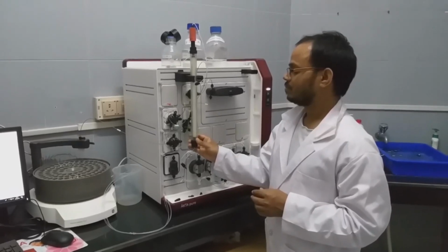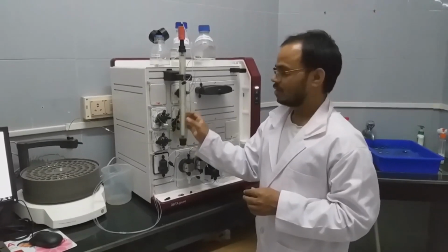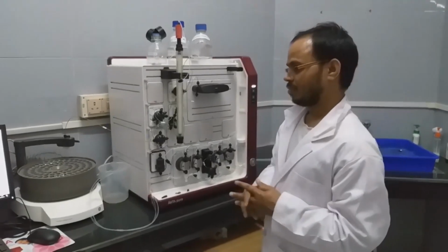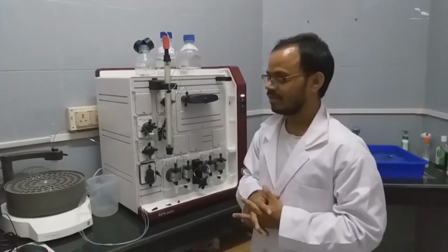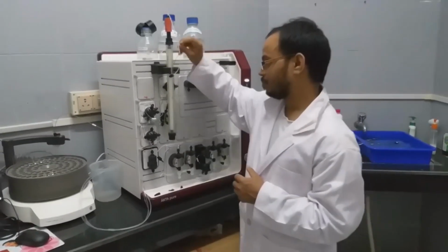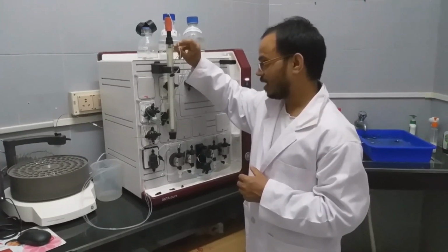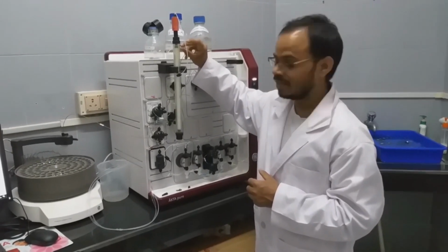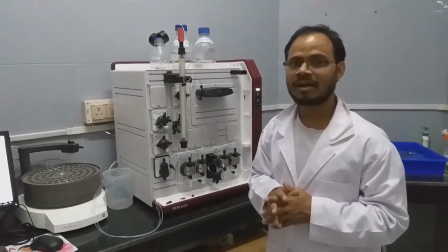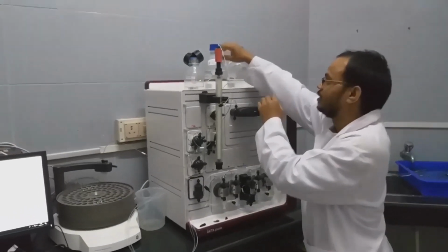Before connecting the column, we have to remember a few points. This column, whatever the beads are there, is in 20% ethanol. So if you directly connect it, ethanol is already there. Whatever flow rate we are giving, it will give more back pressure. So the distance between the column filter and the settled beads may increase, and that will reduce the efficiency of the column. So what we will do, we have to change these pumps into water.